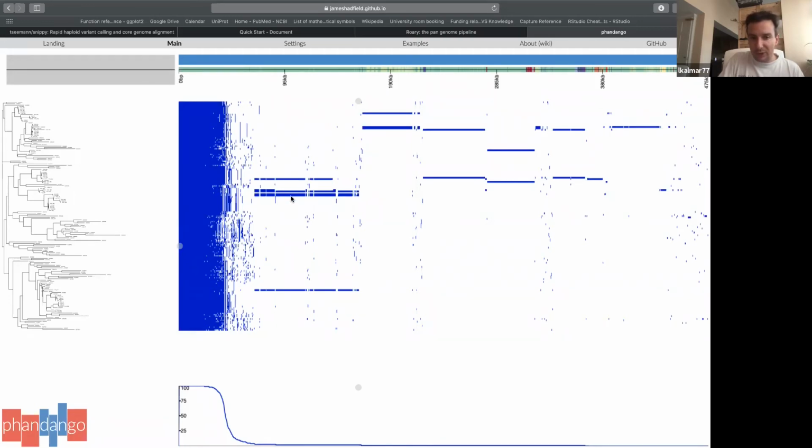Of course, there are bigger parts as well. So if you look at this, for example, this is the plot of 3 or 4 different isolates, and they are all having these genes. Of course, this one has as well. But usually this is what you are looking for.